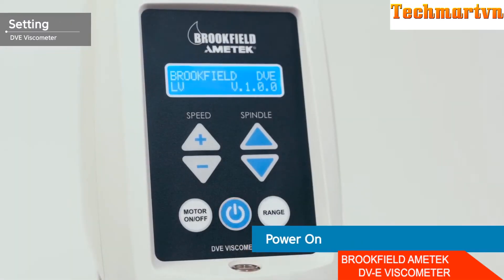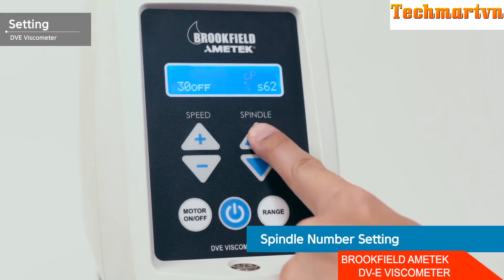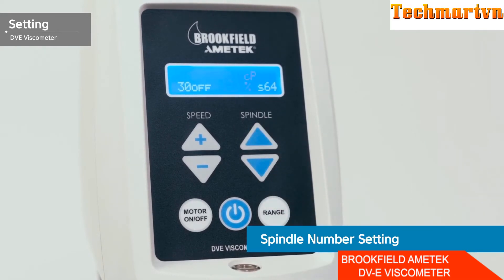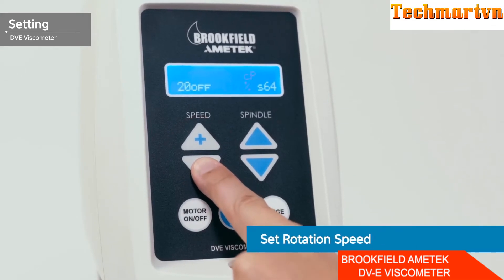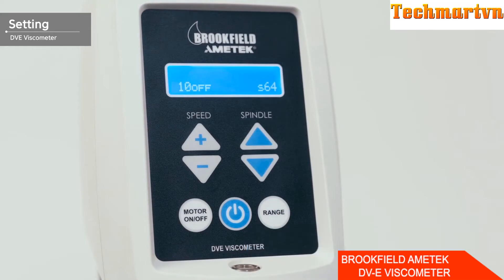Turn on the main body by pressing the power button in the center. Press the spindle button to select the spindle number, then press the speed button to set the desired rotation speed. For low viscosity samples, select a high RPM rotational speed; conversely, for high viscosity samples, select a low RPM rotational speed.